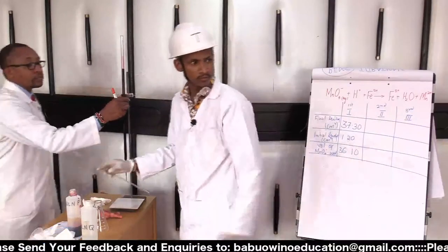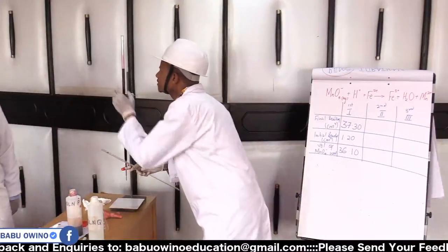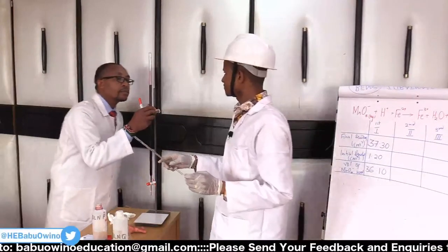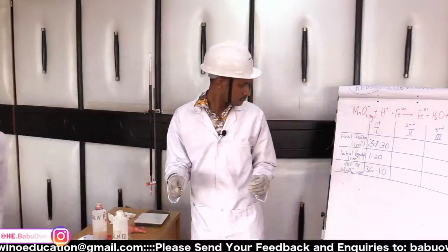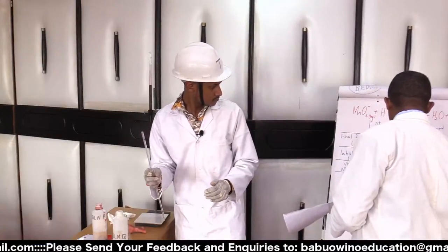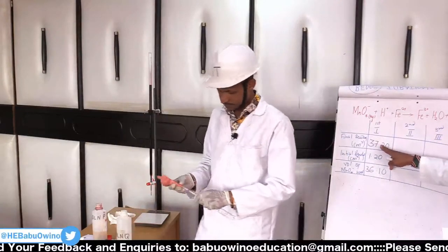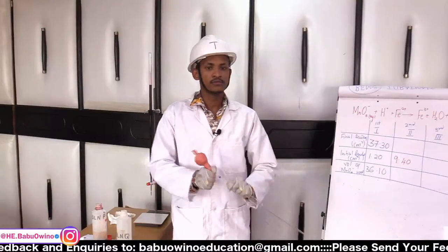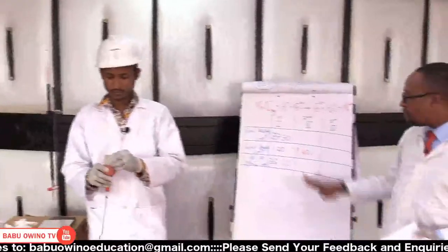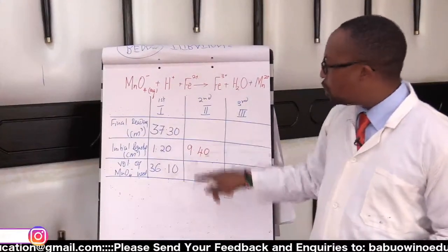Our initial reading is 9.4. We have started with 9.4. Remember again where you are indicating. If you indicate these values in the wrong boxes, that means an inverted table, and with an inverted table you will be wrong and you will not score.